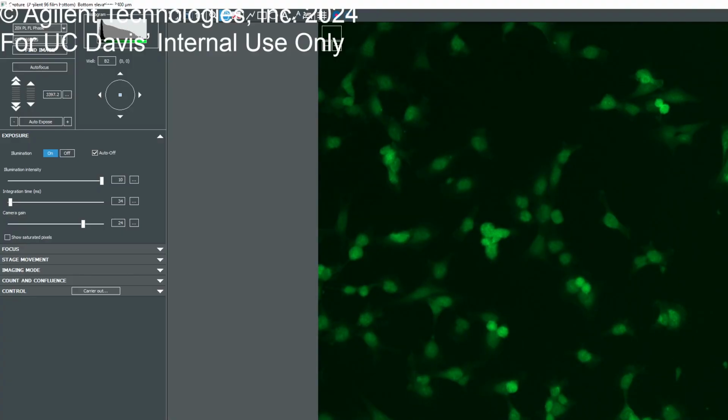So what I got is that after you do autofocus, you do auto exposure again. Yeah, one more time. So auto expose, autofocus, and once that is in focus, then one more cycle. So from the point it is perfectly in focus, you just do one more cycle of the same.